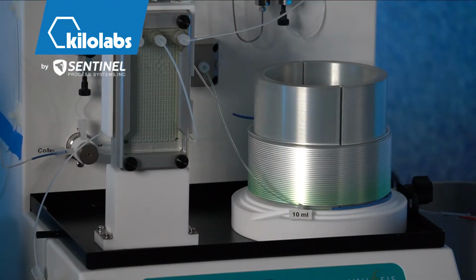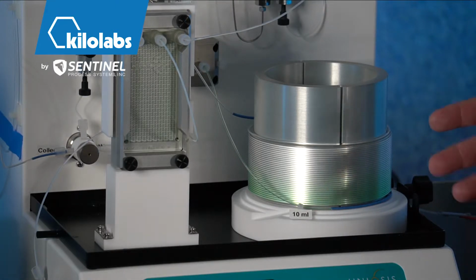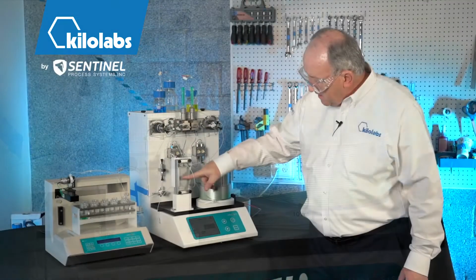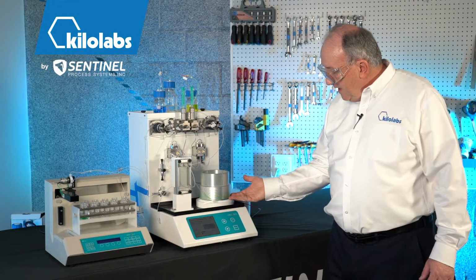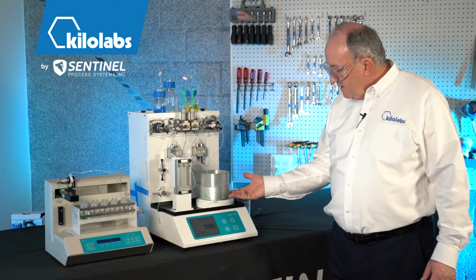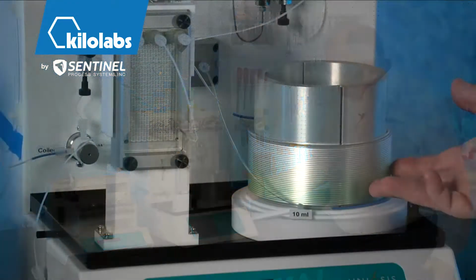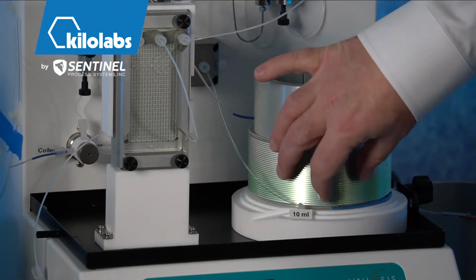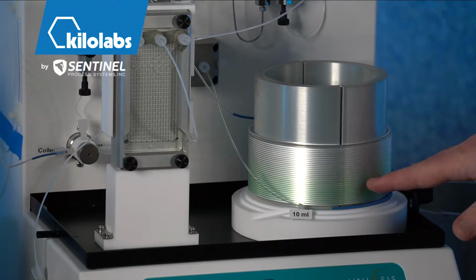Okay, so we've got 2.5 minutes left. As you can see, the valves are switched over again because the 4 ml have already been committed. So we've got solvent going through the mixing chip, and that's starting to clean out. And the green band with the 4 ml that I put in here is now starting to advance again through the coil. And the solvent is coming behind that, and that's pushing out the last volume, if you will.